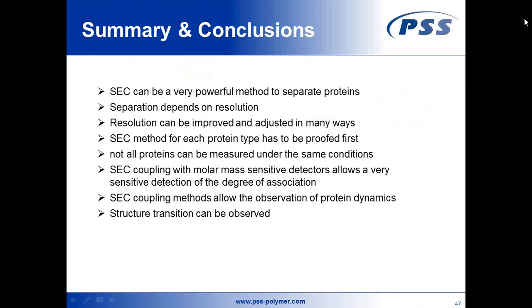Again, the light scattering detector can be used when the protein is large enough and you want to get this radius of gyration information. Below 10 nanometer size of the protein, the light scattering detector would not give you any radius of gyration information.